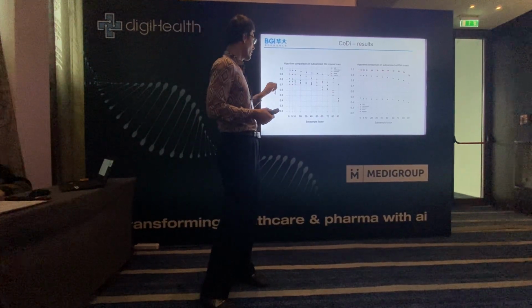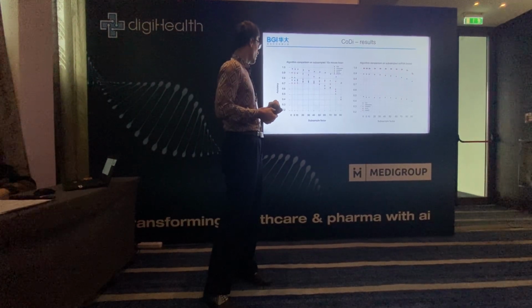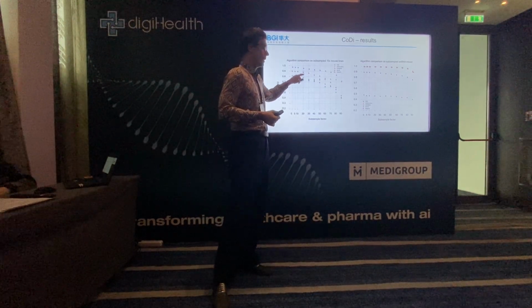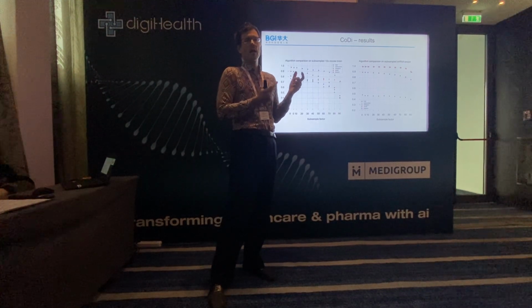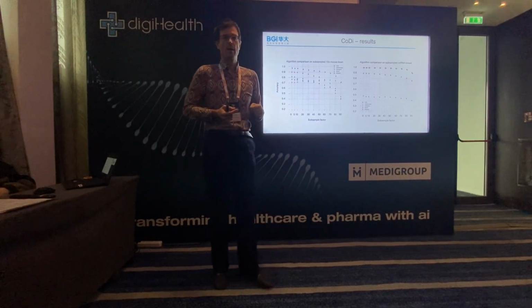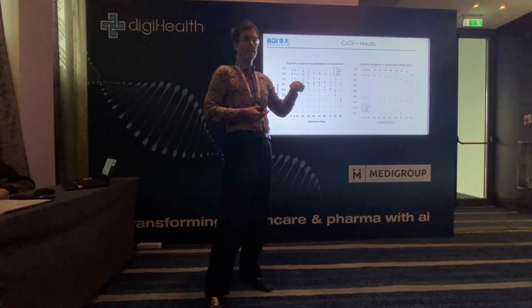The first one is performing a comparison in the cell type annotation process on subsampled data sets. So we have a single cell reference data set with high quality, and we perform its downsampling with different factors shown here on the x-axis. And we use this downsampled data set as a test.